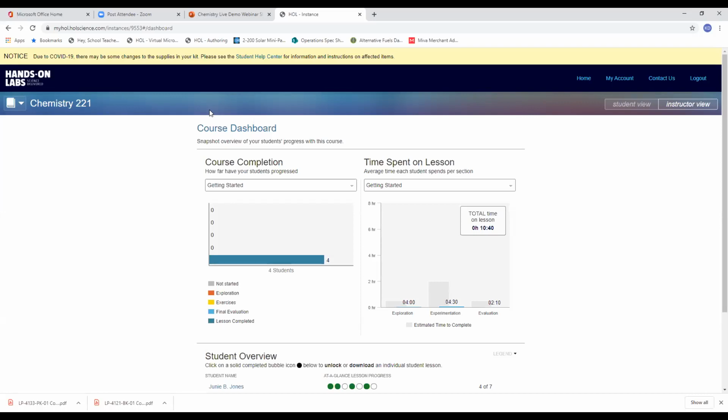Great, thank you. We have a couple questions regarding the materials that come in the kit. Are they plastic or glass? And another question to move on from that is, what kind of glassware is used for a titration?